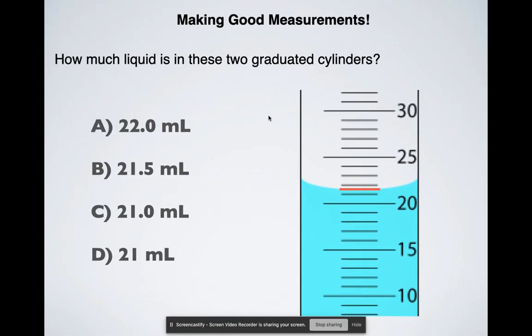All right now how much liquid is in this graduated cylinder? Take a guess. All right so I'll give you my other spiel here that I like to always say. So the reason why I chose these two graduated cylinders is because the increments are different so a lot of times people would just assume oh yeah the increments must be the same so this would be like 22, 24, 26, 28, 30, wait that doesn't add up. So these increments are by one so this is 21, 22, 23 and 24. The meniscus is somewhere between these two so that makes it maybe a little bit easier I guess.